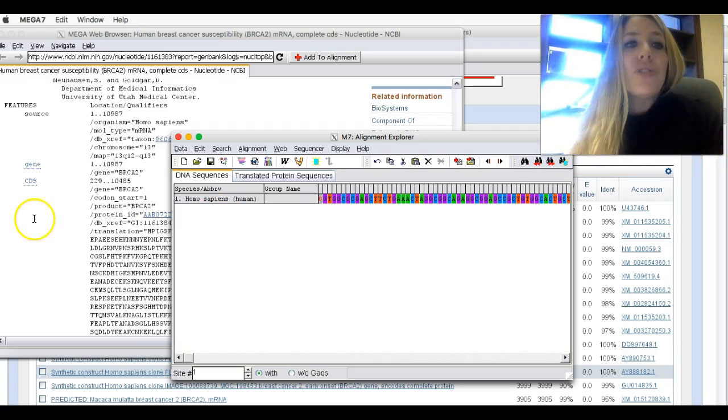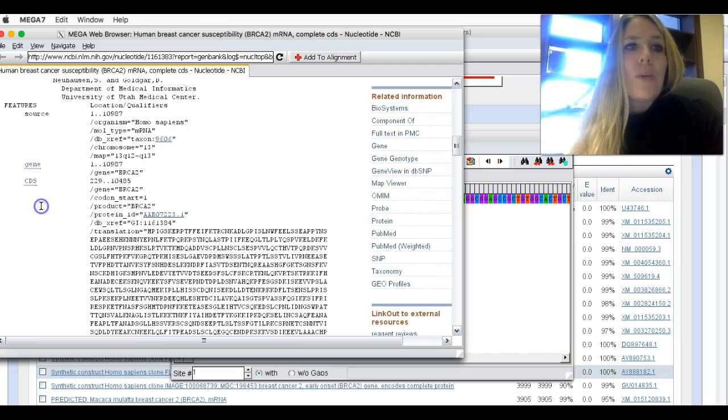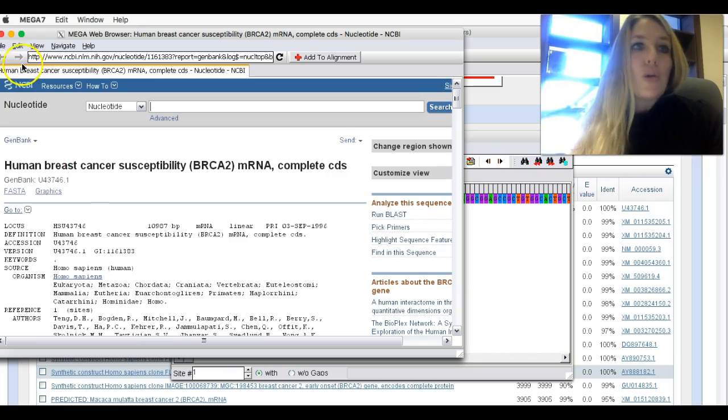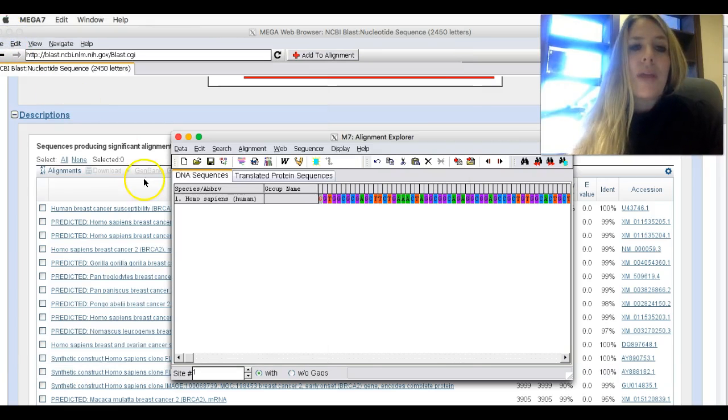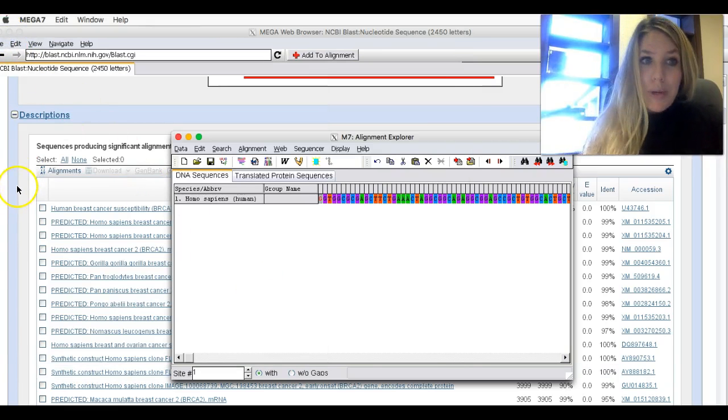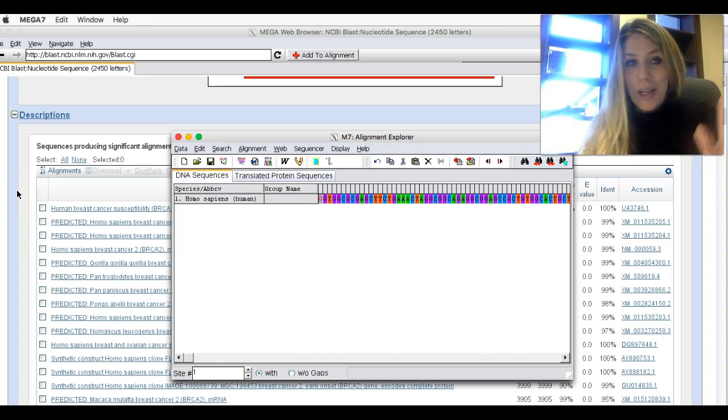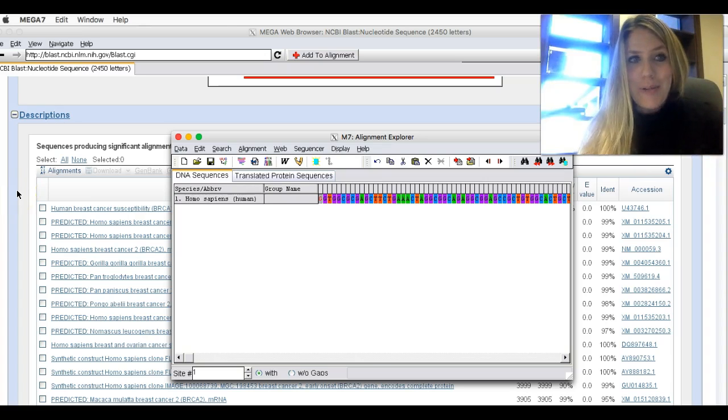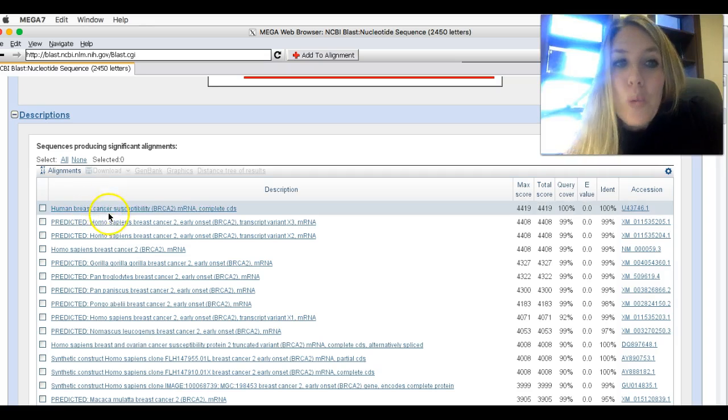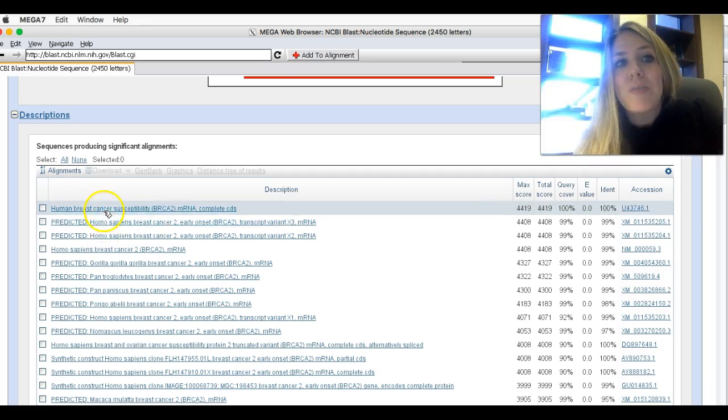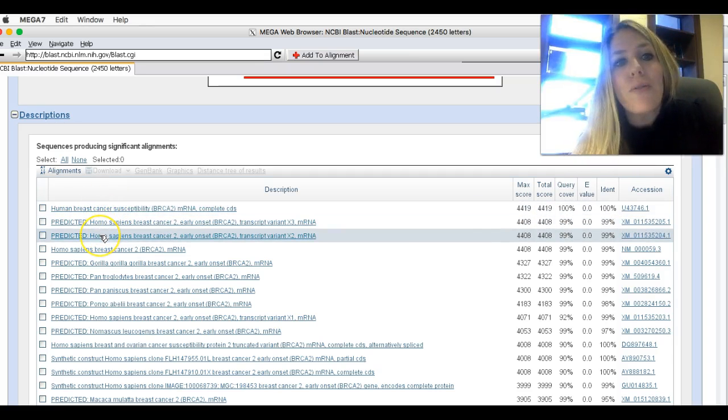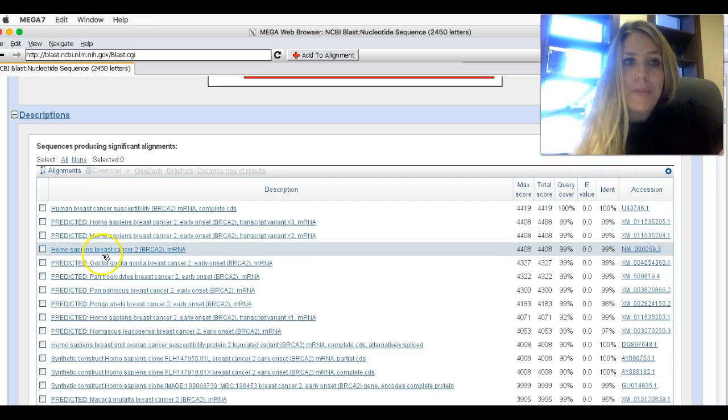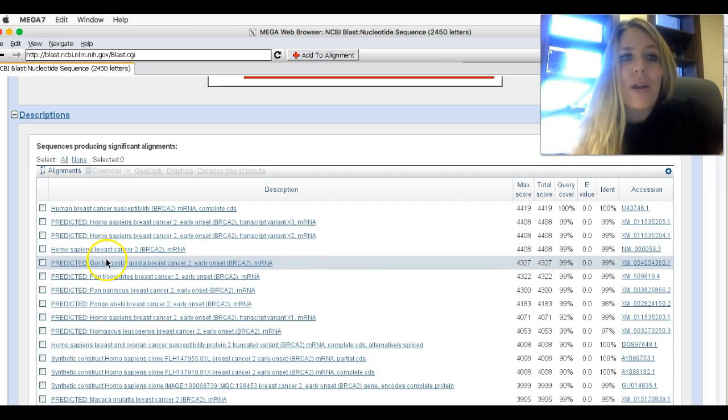Once you've done that, you can go ahead and go back to the window about the human, and you can actually close this out. But don't close this one, because this is the one with our actual blast here. So you want to go back to the blast page. And now we're going to add a second species. Skip over any Homo sapiens. We don't want to add any more Homo sapiens. We got the one we queried.